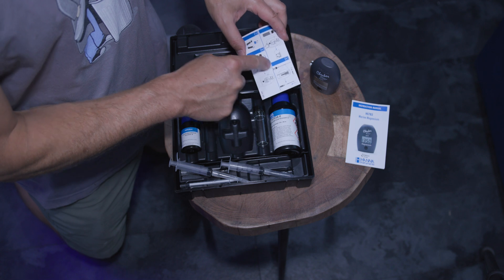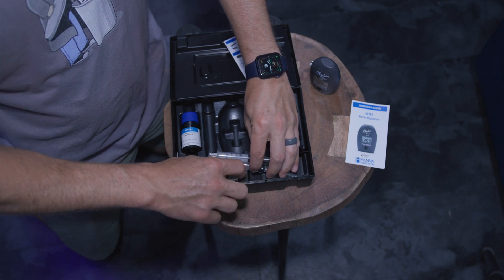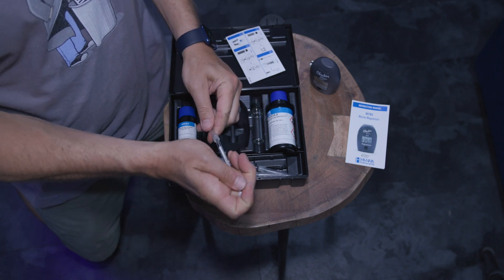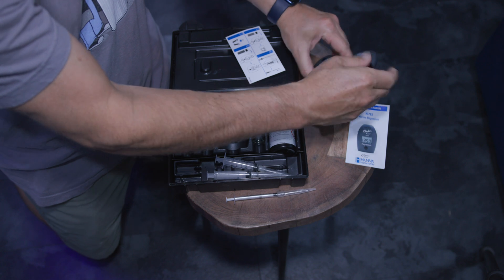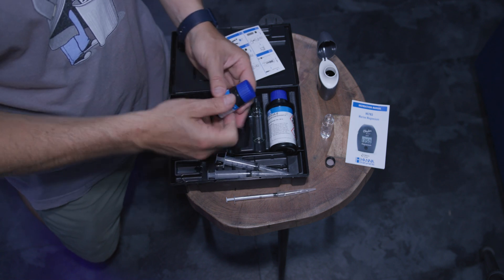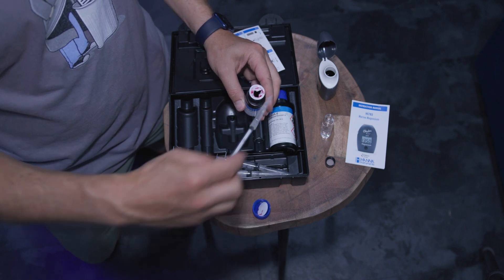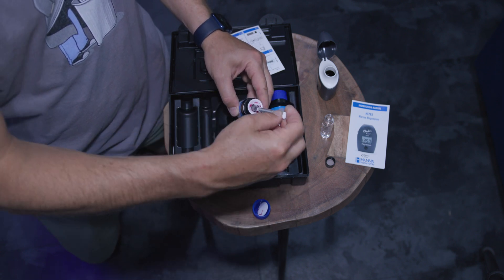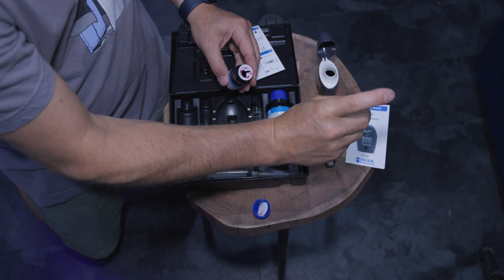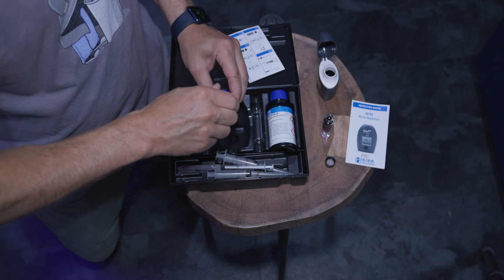All right, C2, one mil of reagent B. And they give us this small syringe here, one mil syringe with a tip. They want us to use the tips that's in all the drawings. So, I'm going to take that out. Set that aside. Reagent B. This should look familiar. This looks very much like the alkalinity reagent bottles, except they filled it with red wine. That's my first thought of that. All right, one mil. Super simple. And I'm going to dump it in here. Close that up before I make a mess.